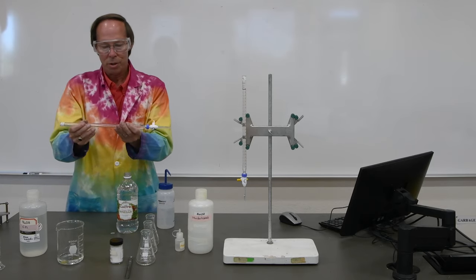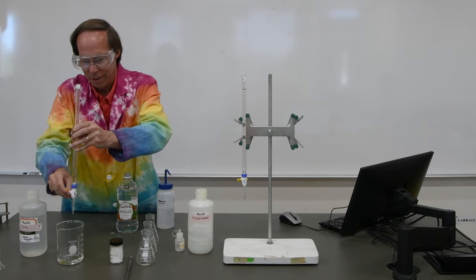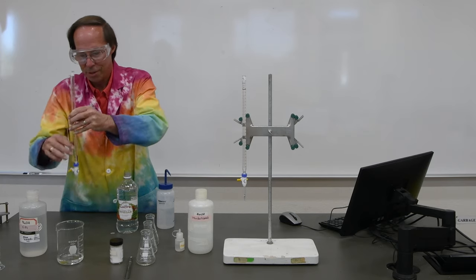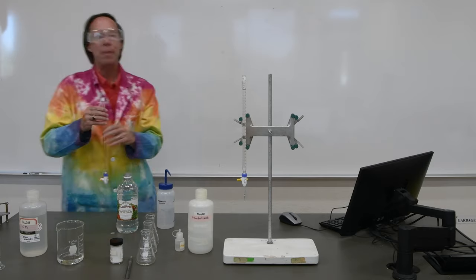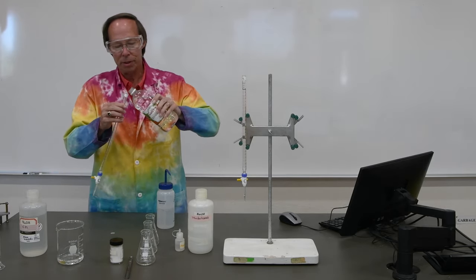So again, we'll give this a bit of a swirl here to rinse out the inside, and then let some of that drain out, and then pour the rest out. So now our burette should have nothing in it except vinegar. Now we can go ahead and fill it.